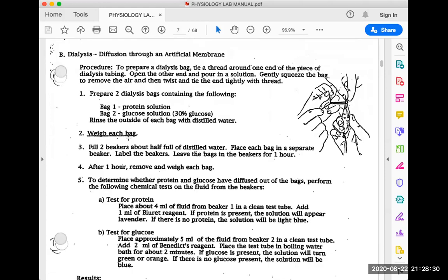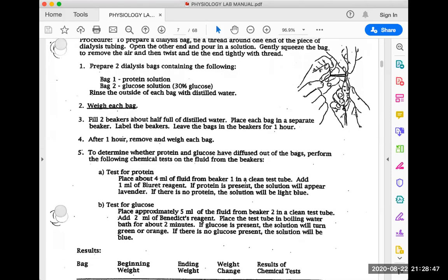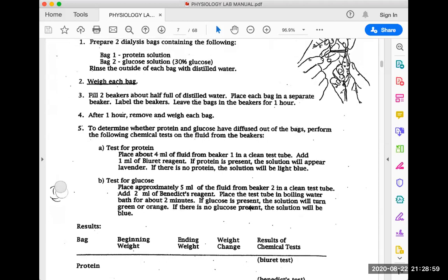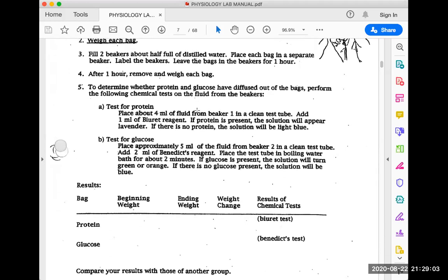In the dialysis procedure — diffusion through an artificial membrane — we prepare two dialysis bags, one with a protein solution and one with a glucose solution. We leave the bags in beakers for one hour, then remove and weigh each bag to see if it gained or lost water and to determine which way water osmosed. We then test to see if protein or glucose diffused out of the bag. Using the biuret reagent, a lavender color indicates protein diffused out; we test for glucose using Benedict's reagent. Proteins are much larger than glucose molecules, so proteins would normally stay in the bag while glucose might diffuse out.